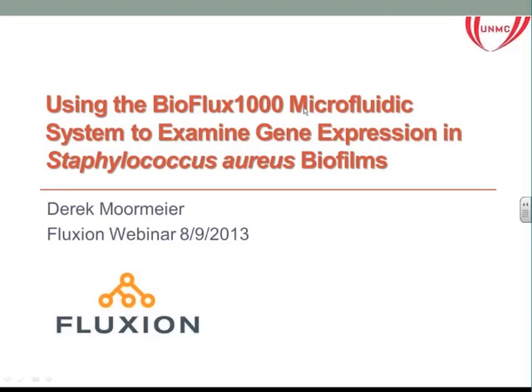I'll begin by giving you a little bit of background for people who aren't bacteriologists and are just viewing to see the utility of the system. First, I'll start off with some background about Staph Aureus, then I'll get into a little bit more detail about biofilms, how they develop, and then I'll get into the particular operon that we work on in our lab and the functions that we see them having. And then I'll get into some of the pictures and the videos that I've taken looking at gene expression inside of these Staph Aureus biofilms, and then give an insight into where we're looking to go and how we're going to use this system further on.